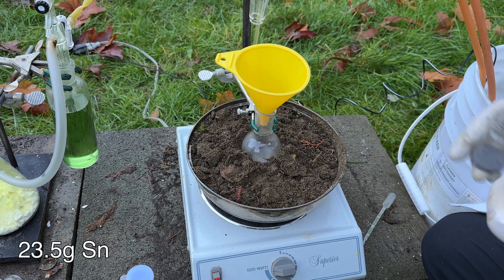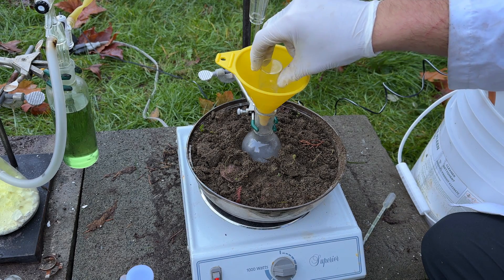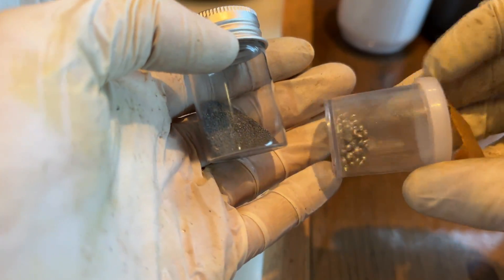Next, 23.5 grams of tin metal was added to the 100 milliliter flask. The finely divided tin produced in a previous video was used, as well as some larger tin spheres on hand.